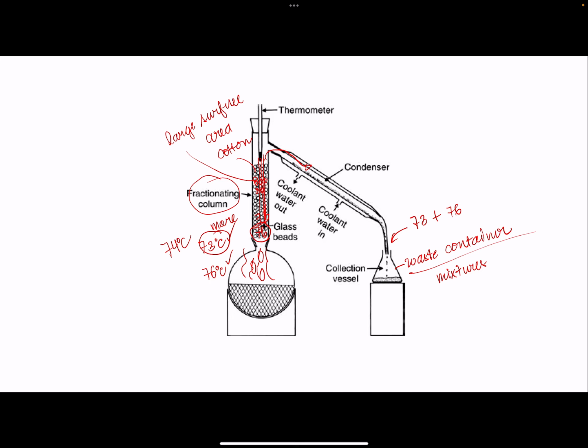And then after a few drops or after a few minutes, you're going to replace the waste container, papalitan mo siya ng bagong vessel, which is going to collect the purified extract. Okay, so it's a bit more complex, but again, I would only like you to remember that your fractional distillation is used if there are more complex solutions.